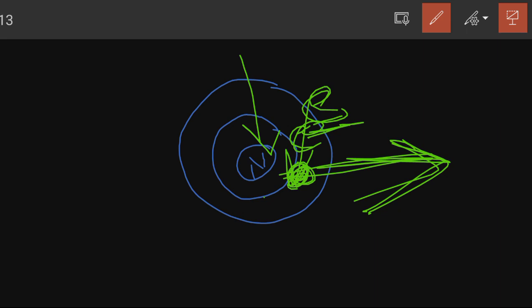The difference in energy between the higher energy shell and the lower energy shell may be released in the form of an X-ray. The number and energy of X-rays emitted from the specimen can be measured by the energy dispersive spectrometer. So this is the whole phenomenon of the energy dispersive spectrometer. Again I am just repeating, the incident beam may excite an electron in the inner shell.